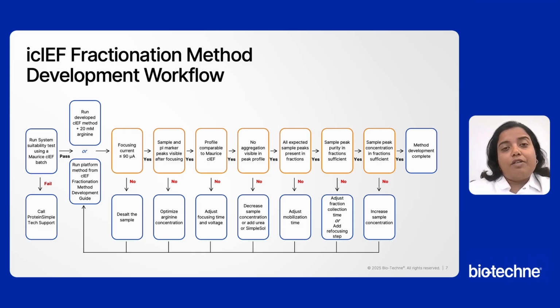But for more challenging molecules that do not fractionate well or have limited solubility, for those I'll further discuss method optimization and the different steps as shown in the workflow chart.